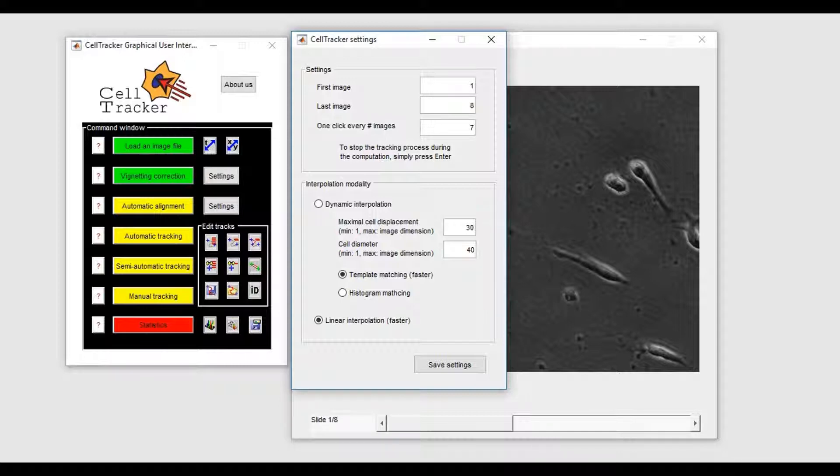In case of dynamic interpolation, a globally optimal path is defined maximizing the matching between the cell template and the images, restricting large, unrealistic jumps.